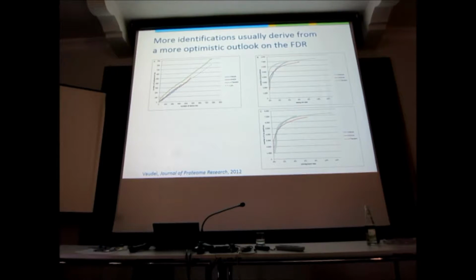And then what we do is we plot the number of decoys against the number of target hits. So at any point you can calculate the FDR for that point by taking this and dividing it by that. So the thing is, you see here this line. For Mascot and OMSSA, they follow that really nicely. And this is exactly what you expect. They're precisely at the place where we expect them to be. Okay? They give you the right number of hits.